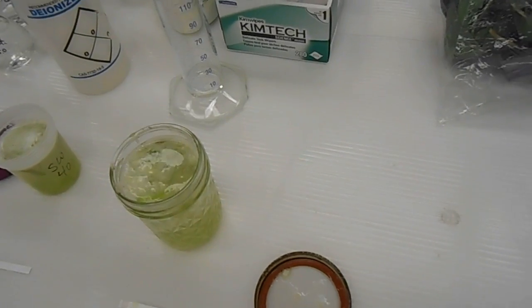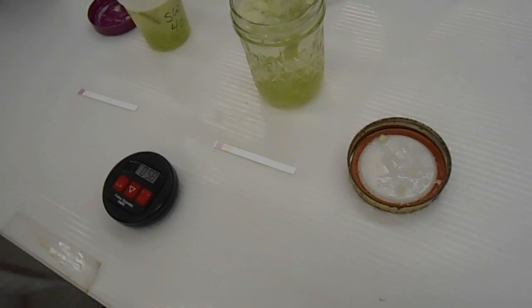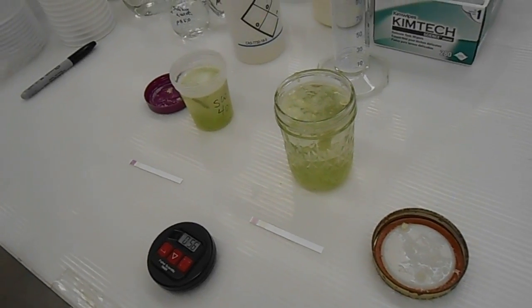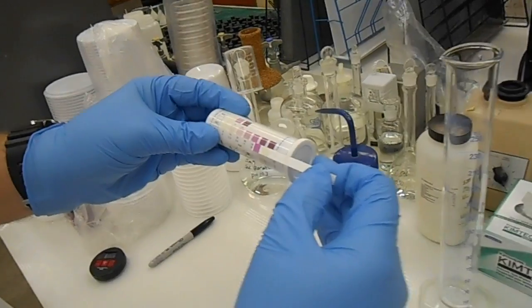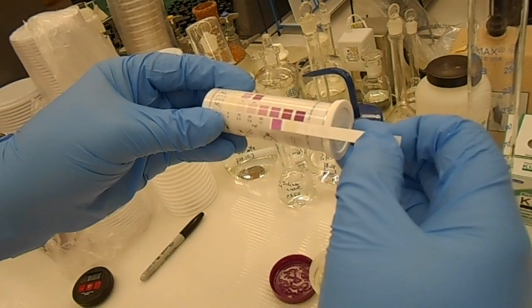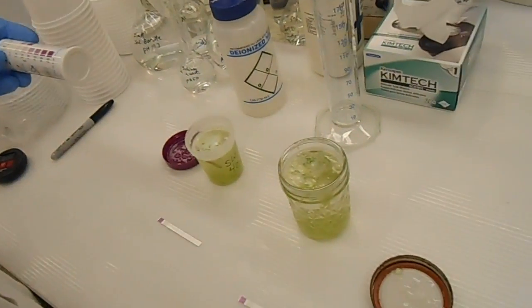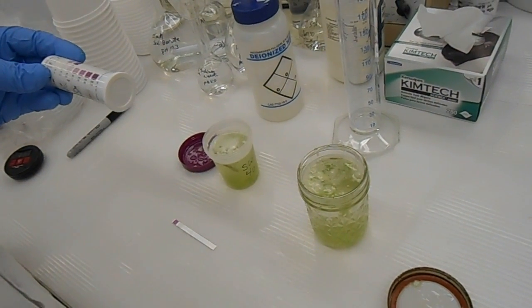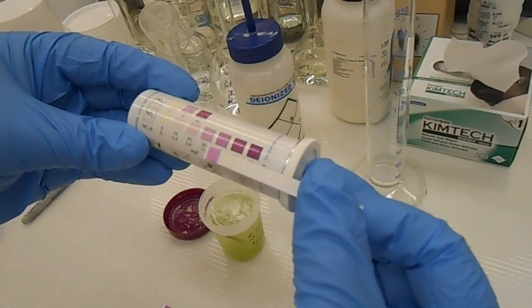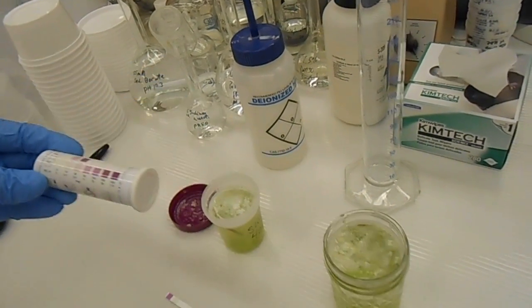Once you have estimated what the test strip reads, multiply it by the dilution factor to give you the final concentration in your corn stock. For five grams in 100 ml, the dilution factor is 20. For five grams in 200 ml, the dilution factor is 40. So if the estimate from the test strip is 20 ppm and you used the specimen cup, you apply a dilution factor of 20.